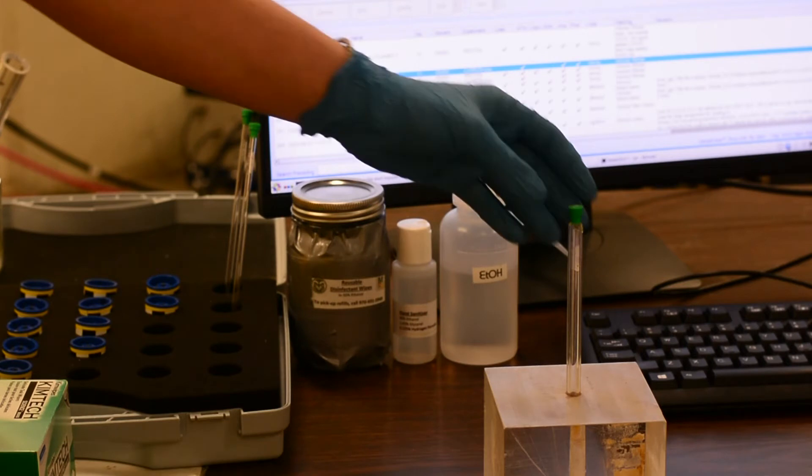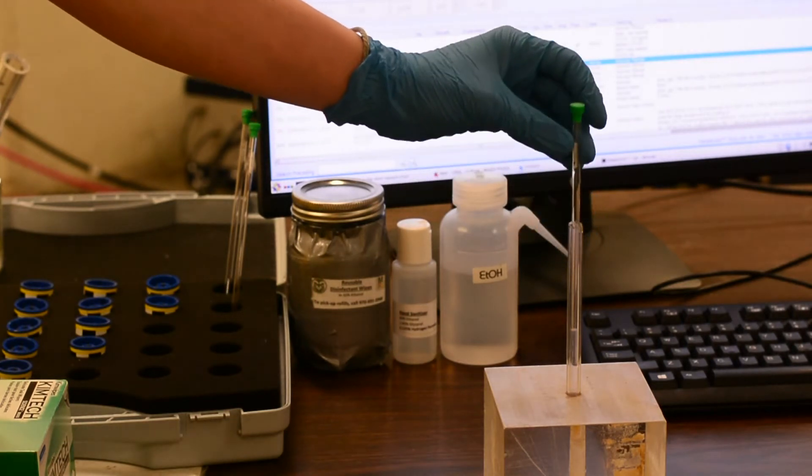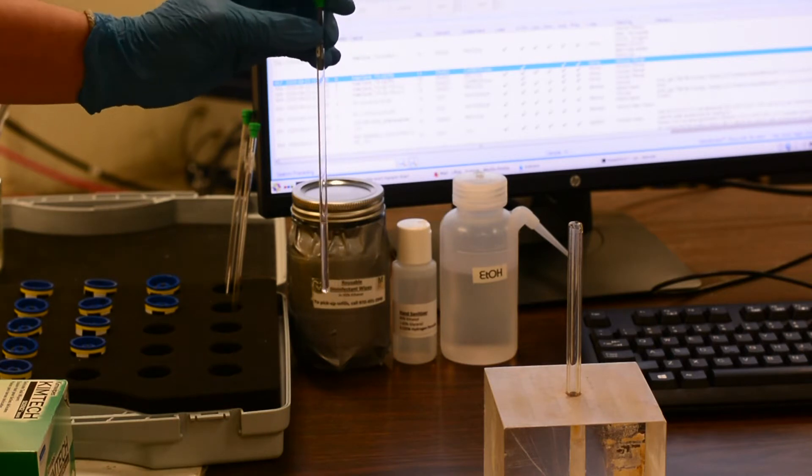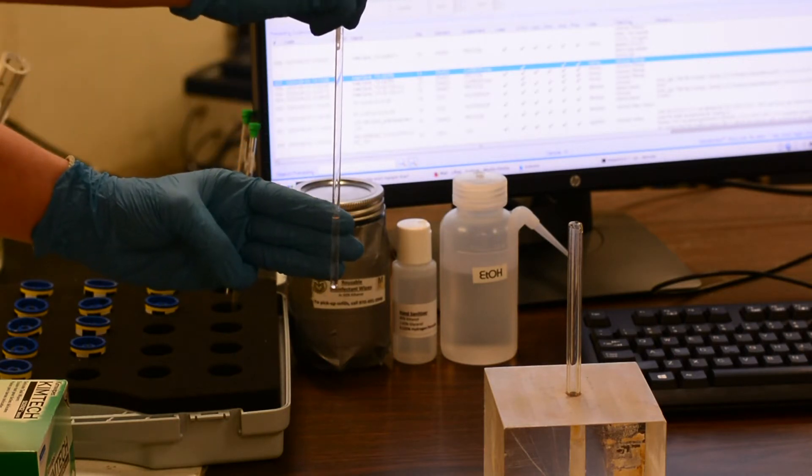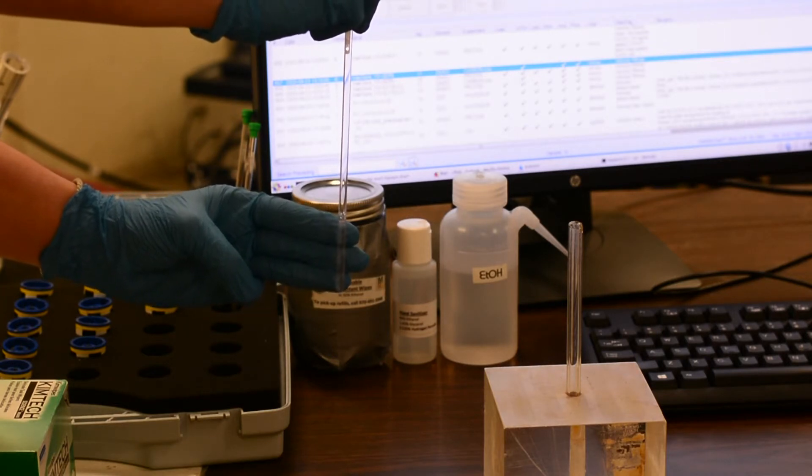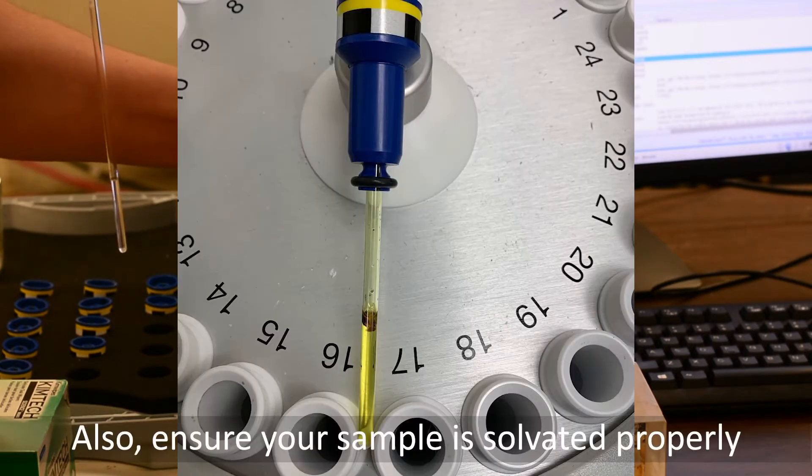The next thing to consider when preparing your sample is the amount of solvent you'll use. A good rule of thumb is the rule of three fingers. If your solvent fills up to the top of your forefinger in this image, then you should be good and have enough solvent to get a nice quality shim.